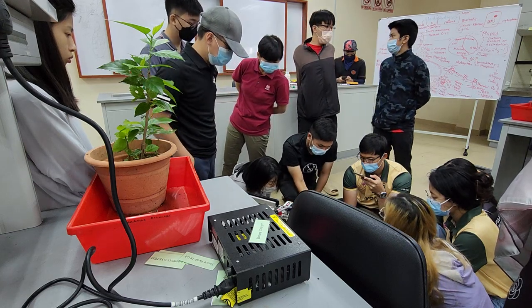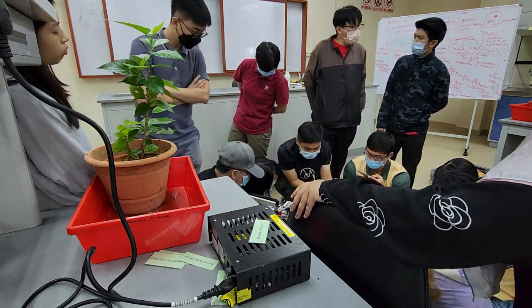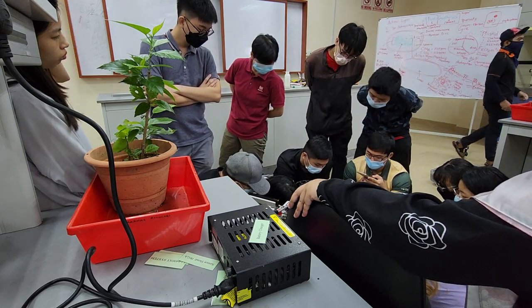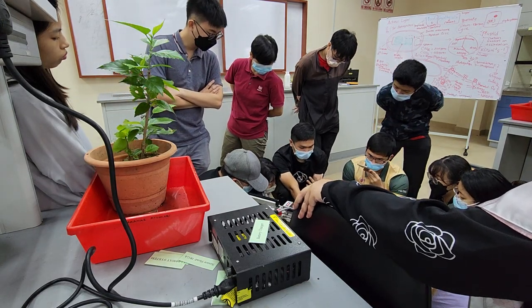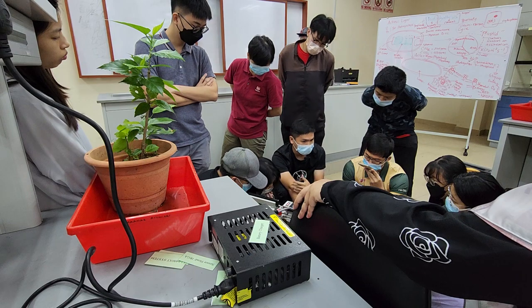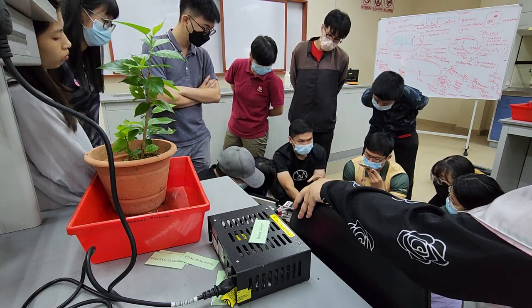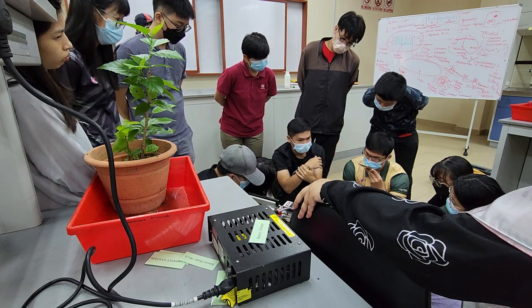Okay, so in the meantime, there are five, 1, 2, 3, 4, 5 environmental factors you need to adjust. There is leaf fan, flow, CO2R, temperature, and lamp. These are general. This can be adjusted based on your research objective. So for the general standard in the tropical region, the leaf fan is the speed of the fan. It is used to break the boundary layer on the leaf so that CO2 can enter.